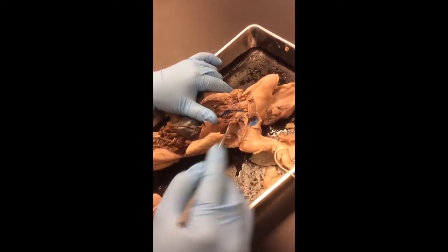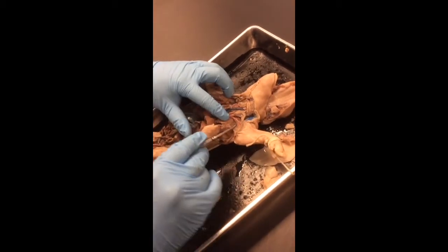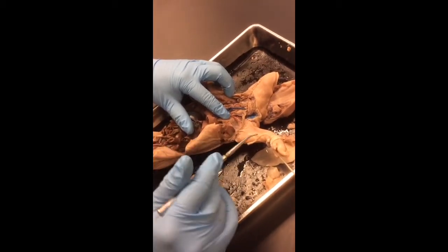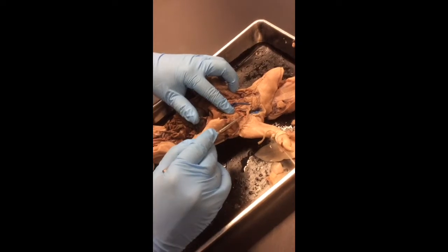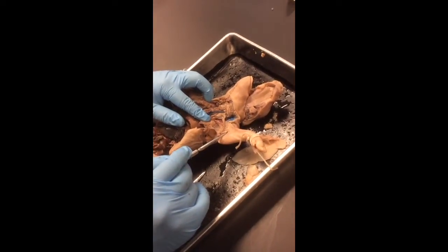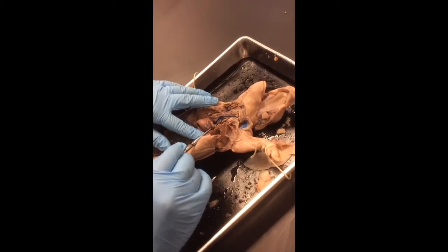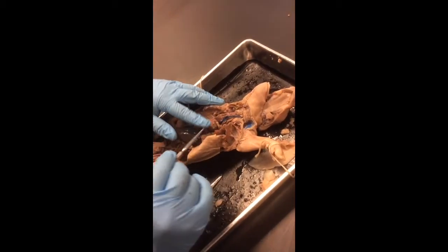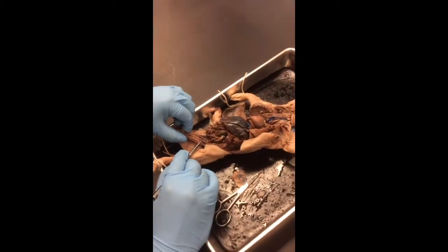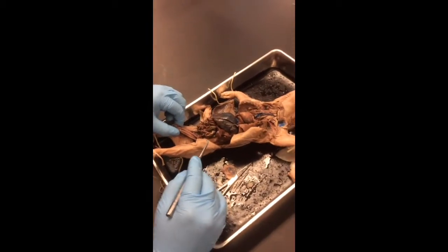The right subclavian or the subclavian arteries. So if it's red and going into the arms, it's the subclavian. If it's blue, it's going to be the vein. So subclavian artery, subclavian vein go into the arms. Pulmonary artery, we just discussed. It's the one on top of the heart. Renal arteries go into the kidneys. Iliac arteries go down the legs. And the two umbilical arteries are right here. Okay, so that's the second column.